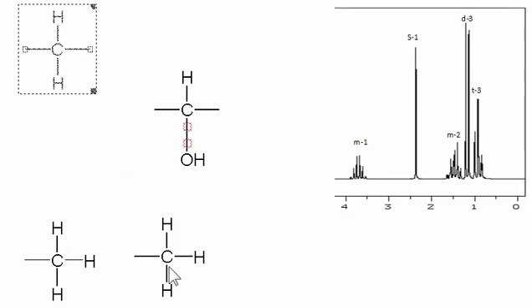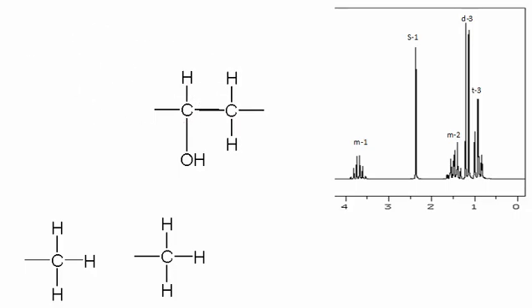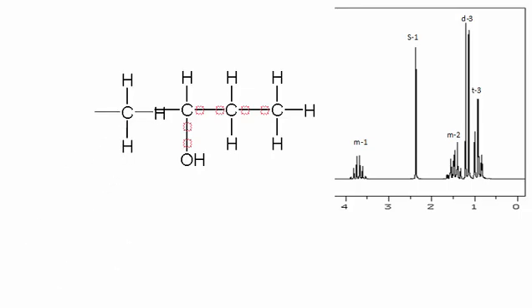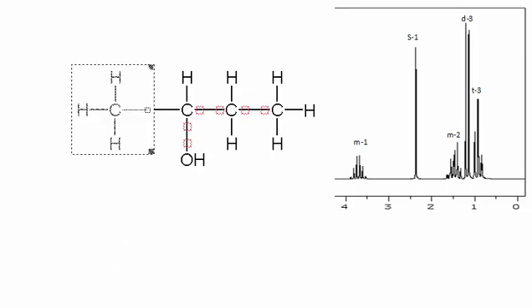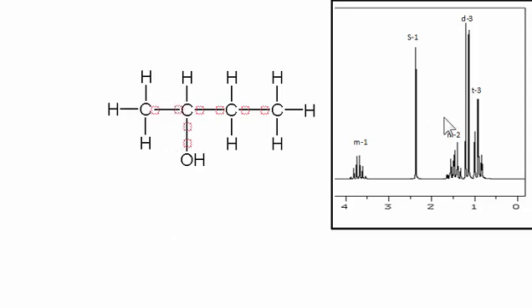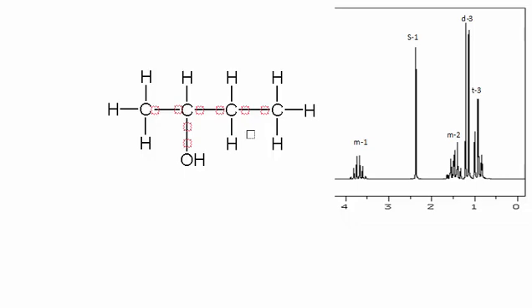Now, the nice thing about methyl groups is they have to go on the end, so that means this has to go in the middle. Okay, and then there's only 2 places left. I can put it here, and I can put it here. Okay, so now I got to rotate this, and I'll put these guys together. So let's see how the data verifies this particular structure.